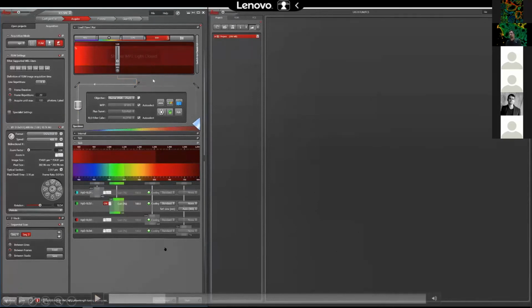Just as a reminder, there is a solution and also a publication from Angelika Hook and Wolfgang Becker and their collaborators, presenting a dual beam infrared laser system that you can switch between super fast. You can excite NADH and FAD and then image them simultaneously, with two laser beams.